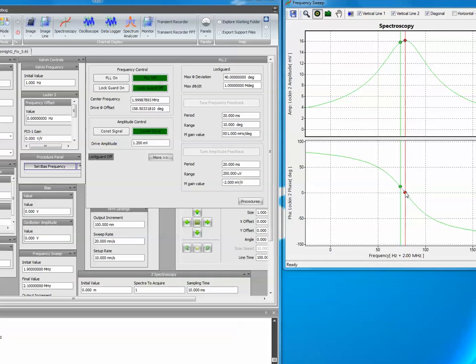What you will see is as the phase goes up and down, also the frequency will go down and up. So with a 10 degree phase angle set point, our frequency will hop down some hertz, and then as the set point hops back to 0, our frequency will also hop back. And we will look at the hopping back and forth on an oscilloscope.